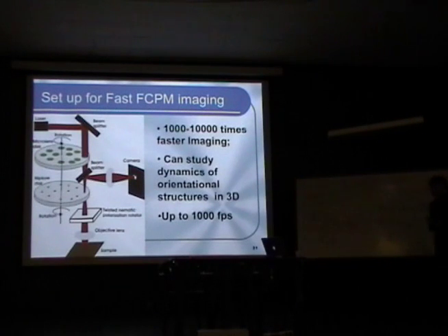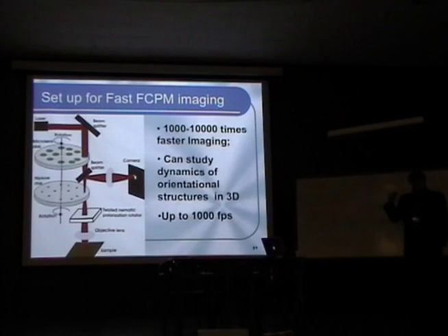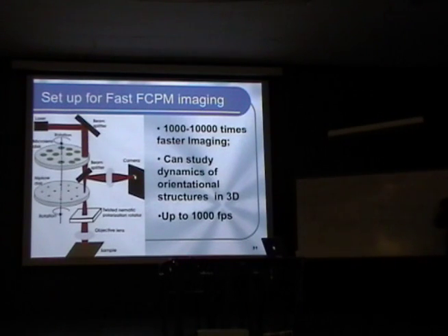Now, one disadvantage of confocal microscopy is that we probe the sample point by point, and it takes some time to scan the laser beam within the sample of interest, especially if the three-dimensional volume of interest is fairly large. It can take minutes or even more. And so that means we will not be able to probe dynamic processes using this technique.